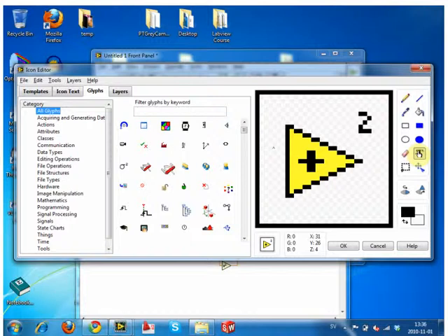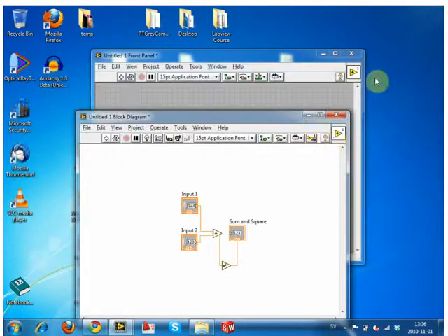And then if you want to put this towards the end, you just use the little selector thing. Just say, I want to move this region, just like Microsoft Paint. Then just hit OK, and boom, it's up here now. So both on the front and back panel, this is now how this VI is shown.